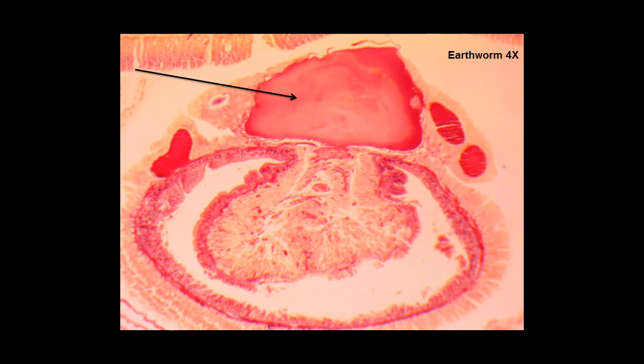Here's a cross-section of the coelom of the earthworm using the 4x objective, which gives a total magnification of 40 times. What we're looking at here is the dorsal blood vessel. This blood vessel lies on top of the intestine and carries blood to the front of the body of the organism.